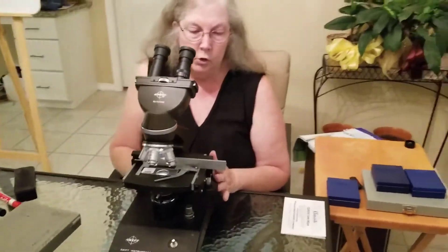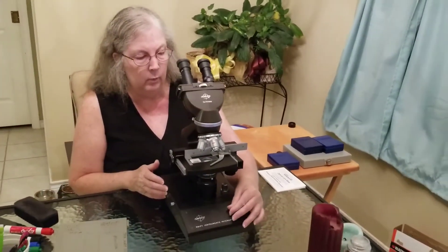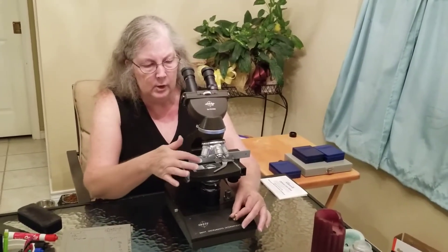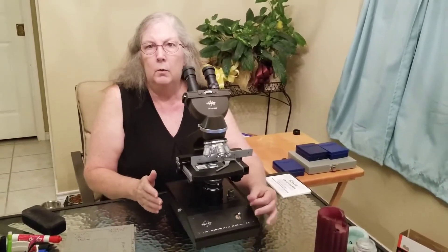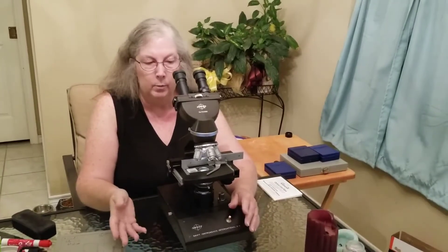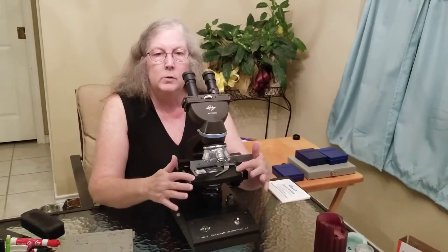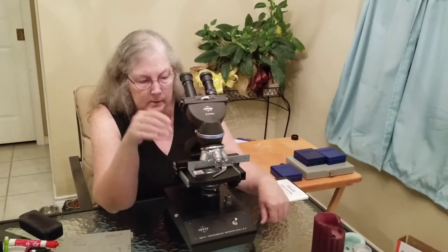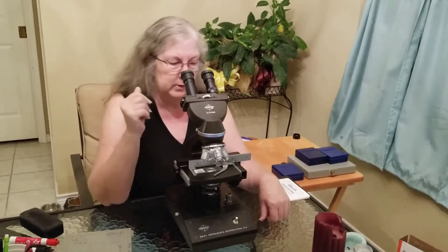Before you observe a specimen, when you get a scope it should have been stored with the light intensity all the way down low, because depending on the brand you can adjust the amount of light. It should be stored on low so when the next person turns on the microscope, you don't blow the bulb. The mechanical stage should be all the way down, and the lowest or shortest objective lens should be in place. All of this helps prevent breakage during storage.